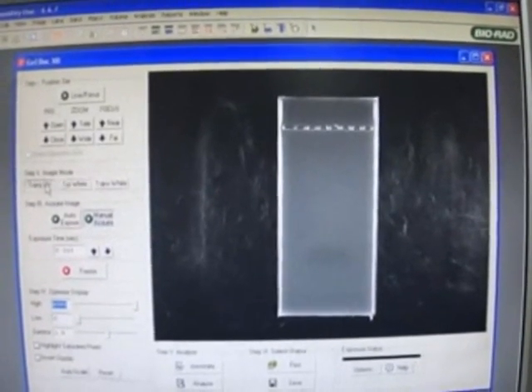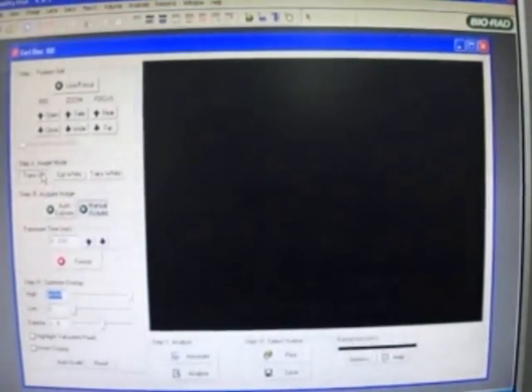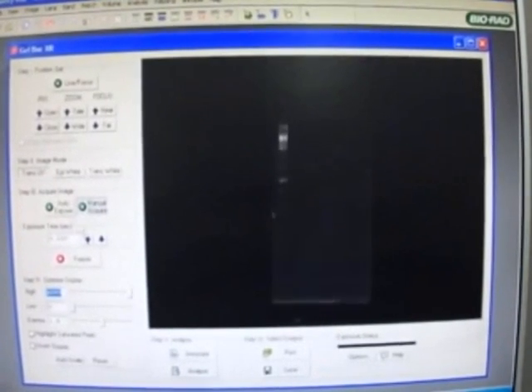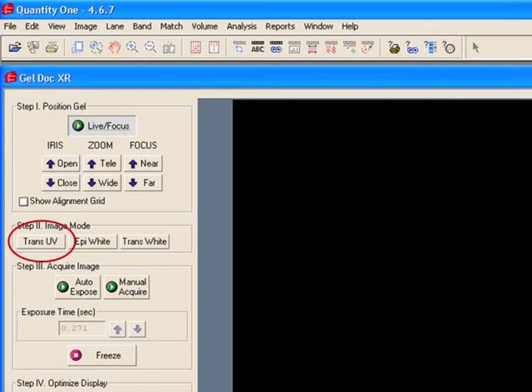Once the gel is positioned and focused on the stage, now switch on the trans UV light. The exposure to the trans UV light can be acquired both automatically and manually.